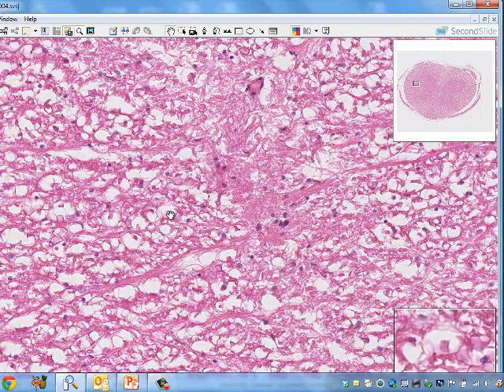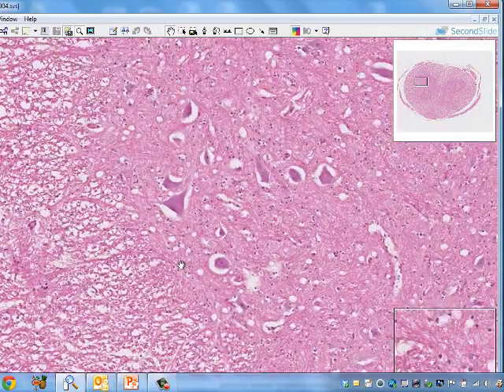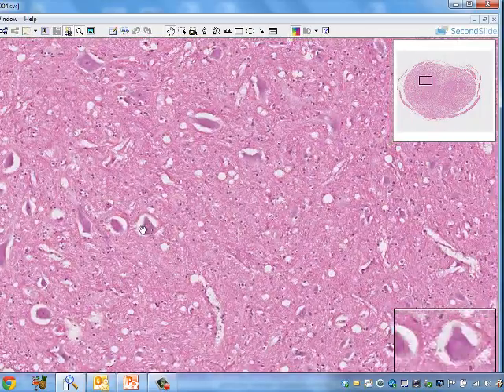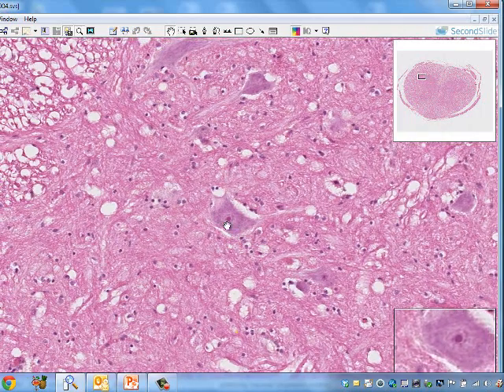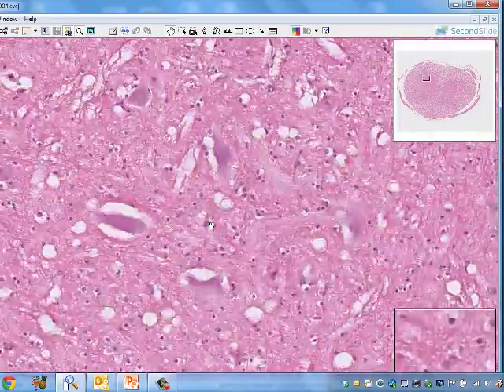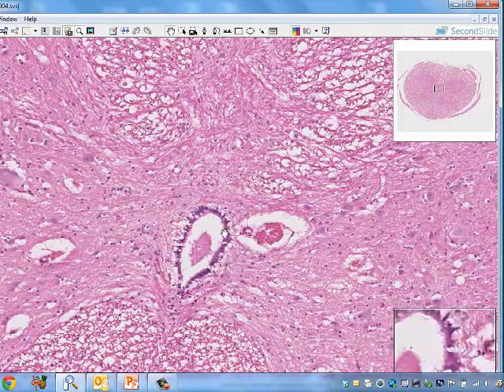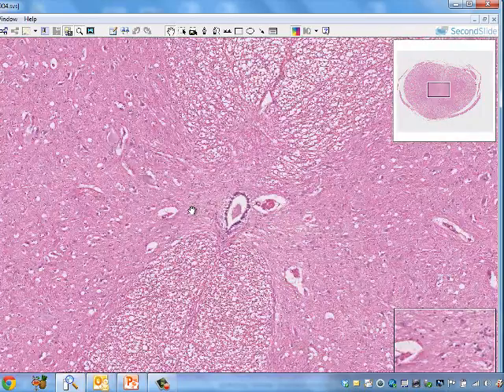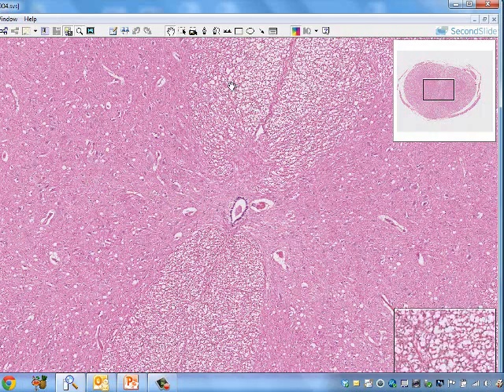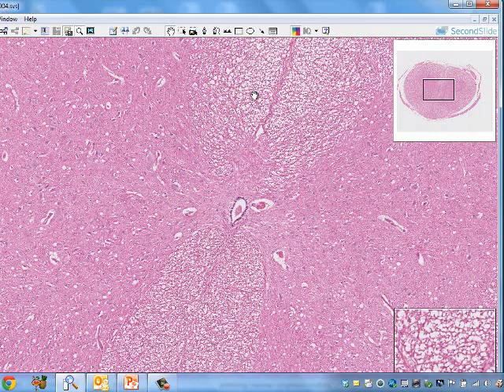And you can see the axons are these myelinated axons that you have in through here, and here we see the cell bodies. These are the cell bodies. Here we can see one with the nucleus and the nucleolus of it, with the Nissl substance inside there. So we can see that. We can see the cells that secrete the fluid in the center of the H, as we can see. So this is gray matter, white matter, cells, transmission portion.